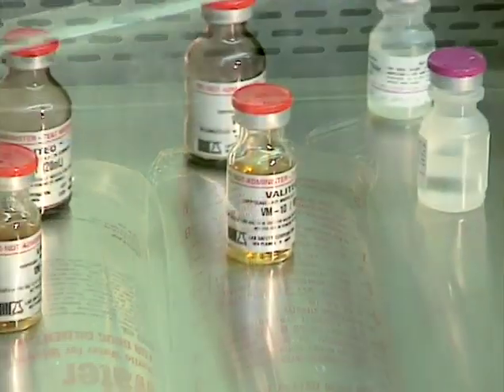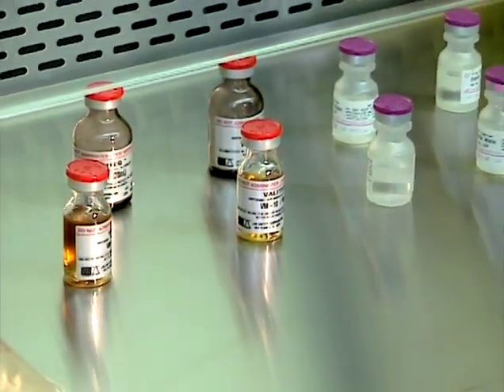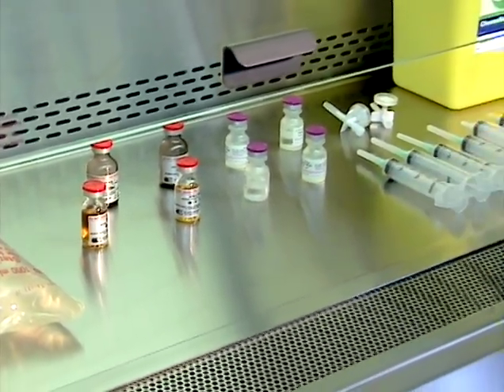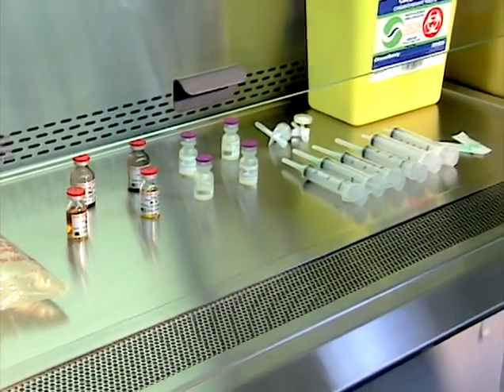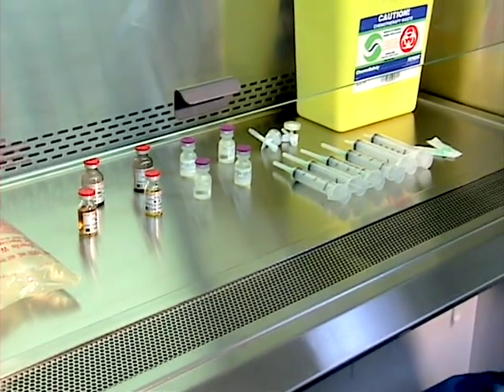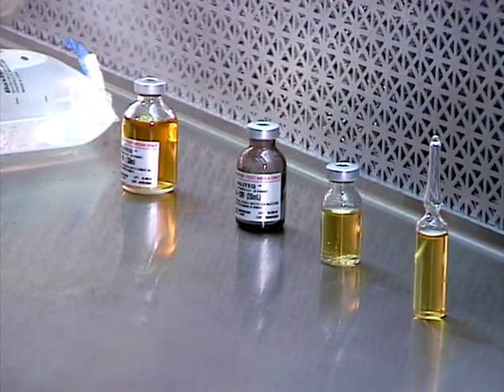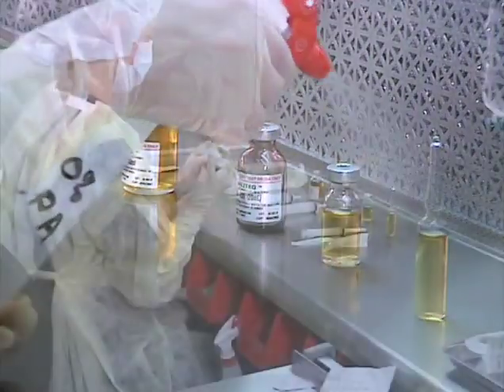When compounding hazardous materials, be sure everything required to complete the procedure has been staged in the hood. Moving the hands in and out of the hood during compounding can lead to contamination of the environment. Disinfect each critical site with 70% IPA by spraying all critical sites or swabbing each individual site with a fresh alcohol swab. Do not open ampules at this time.